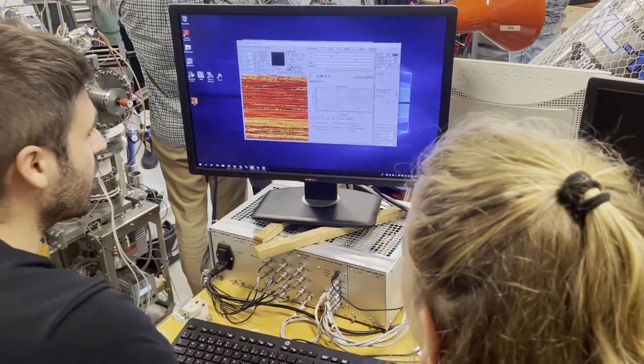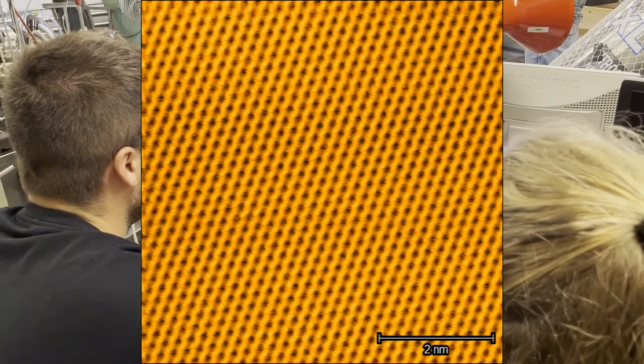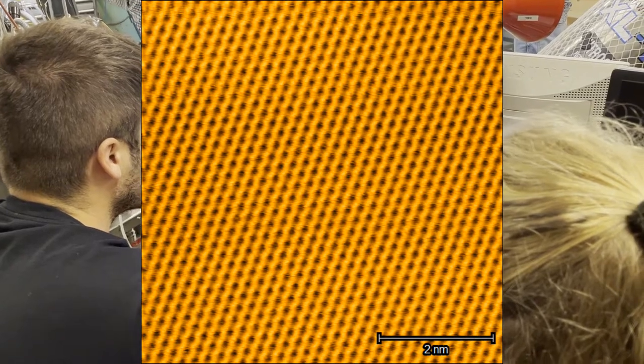We can actually see atoms here, but it might be a bit difficult for an untrained eye. Therefore, we show you an even better image. Here you can clearly see the carbon atoms in the graphite surface.